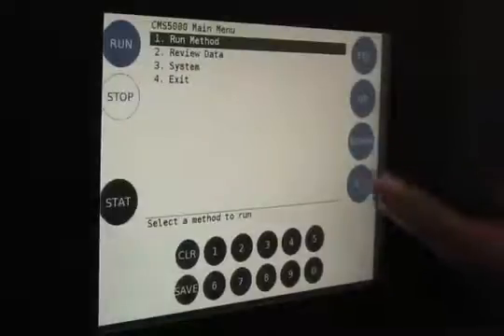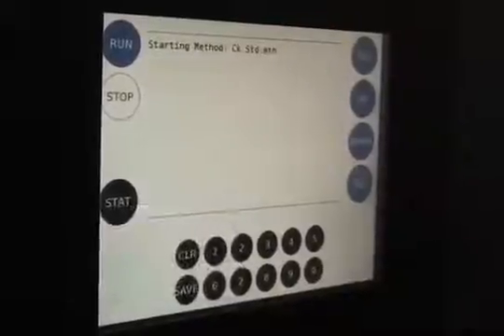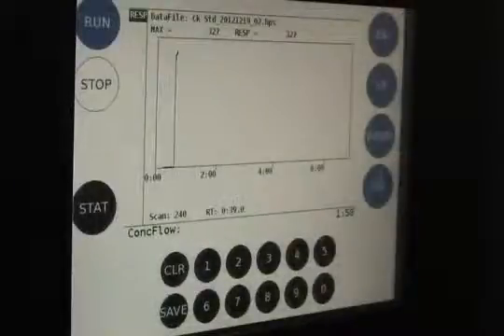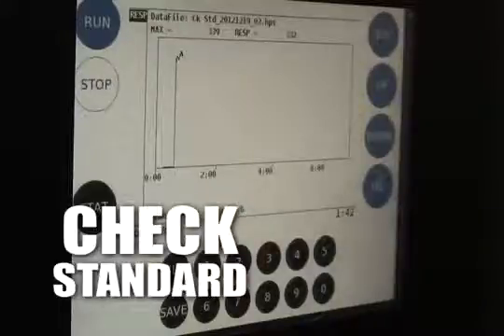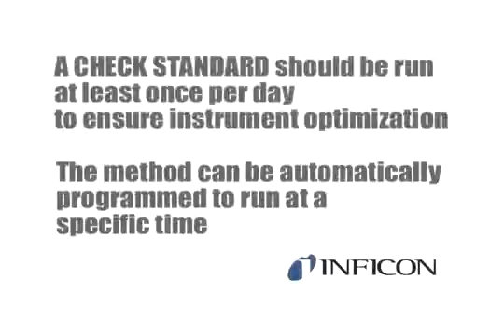From the main menu, select Run Method, then select Check Standard. Upon initializing the check standard method, the CMS5000 will heat the internal components. The zones may be displayed on the front panel. Once the temperatures are stabilized, the 7-minute method will begin. The method can also be initiated from the laptop. The check standard chromatogram is visible on the front panel. Inficon recommends that a check standard is run at least once per day to ensure instrument optimization. The method can be automatically programmed to run at a specific time.